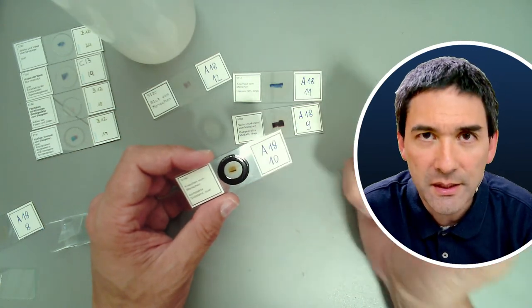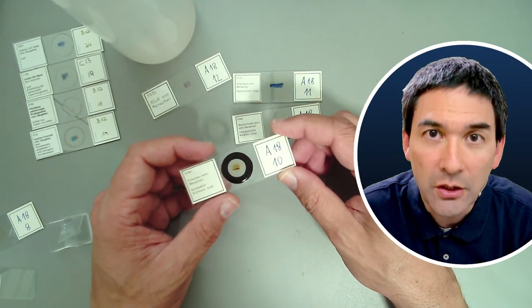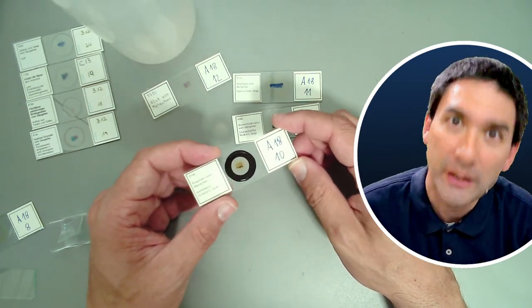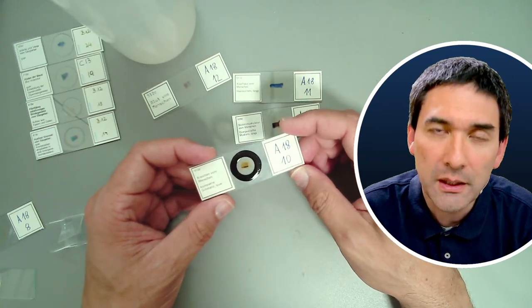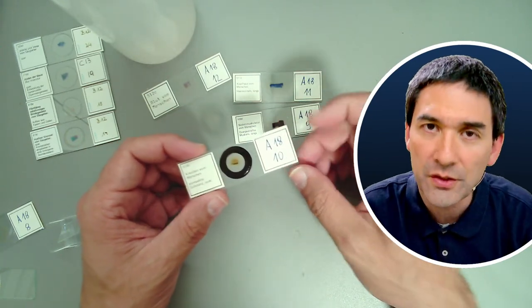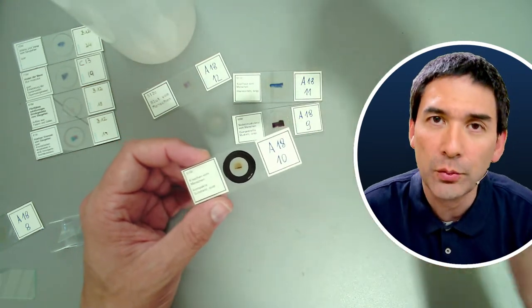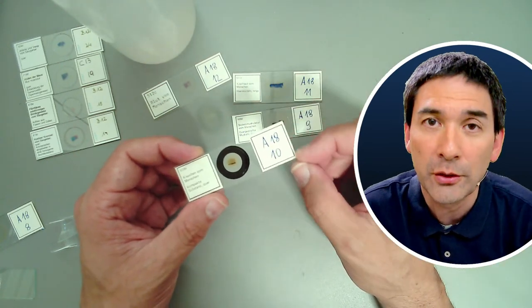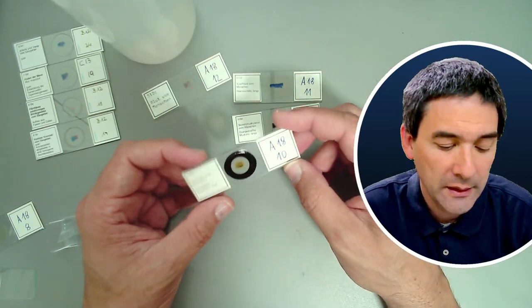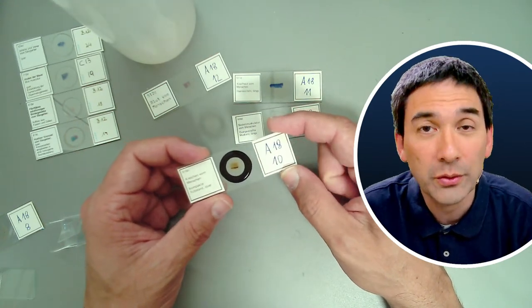For some specimens, they use a mounting medium called glycerin jelly, glycerol jelly, or glycerin gelatin. This is a mounting medium which becomes semi-solid. So when you dry it, it will not dry completely, but it will still contain a certain amount of moisture and water.